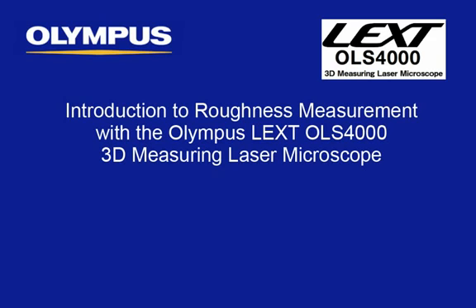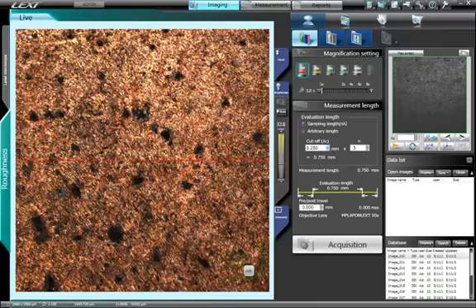This tutorial will provide you with detailed instructions on getting started with roughness measurement on the Olympus LEXT OLS4000 3D measuring laser microscope. The LEXT incorporates a highly intuitive user interface for accurate measurement of surface roughness in compliance with ISO 4287 standard.